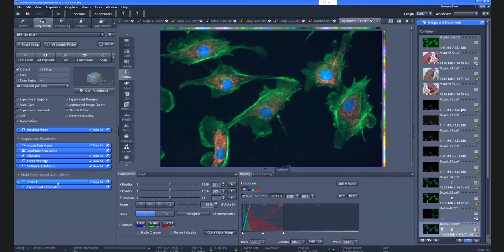Right now we have this available for our confocals, LSM 900, LSM 980. We do have this for our box system, Cell Discoverer. We have it for all the compound platforms like the inverted, upright, binoculars. We do have this for lattice light sheet microscopes, but importing data from other setups who might not be operated with ZEN Blue can be easily done. So if it's driven by ZEN Black, it's the same file format, which allows to do analysis across those platforms. And the future plan is to extend this world of the ZEN Blue into all kinds of systems, whatever comes next and so on.